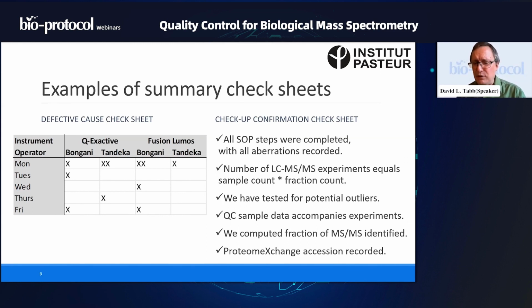Quality control sample data accompanies experiments. This is kind of a controversial thing. A lot of time, a proteomics facility will perform checks of the instrument with a digest of bovine serum albumin or with HeLa or yeast or something like that. And frequently, they don't include those data when they pass you the data for your experiment. You as a user might be interested in those though. So we should at least let the user know that these files exist if they're interested in seeing them.